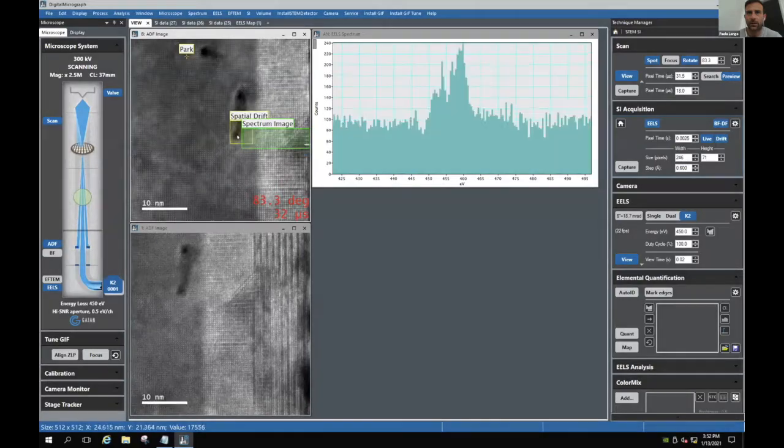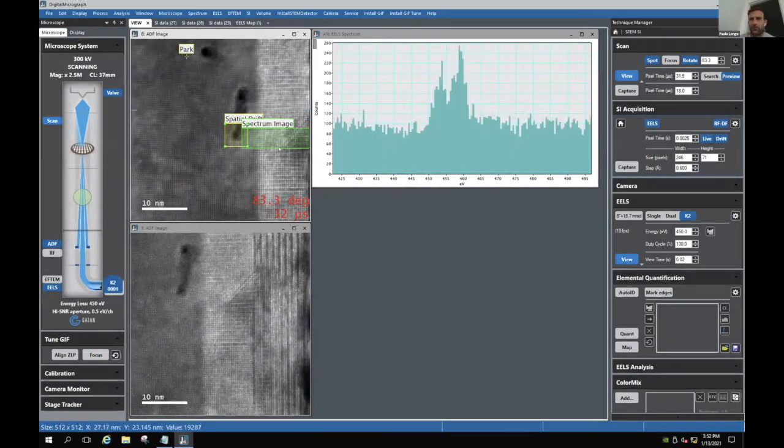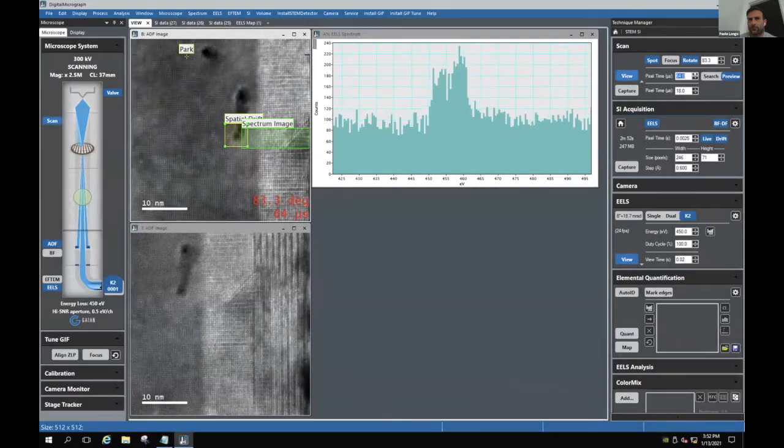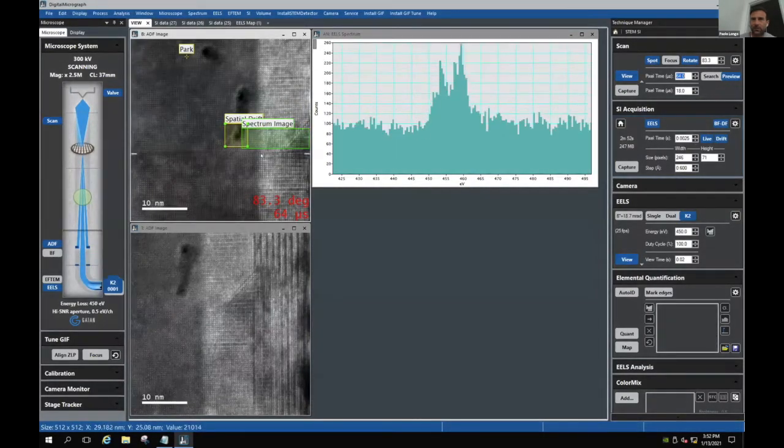I'm going to do it here on this amorphous damage motif, which is a good reference. You don't want to go too far from the region of interest, but you don't want to be too close to the region of interest. We're slightly outside. You bump the exposure time a little bit here because you want to get a good reference image. So now we'll do some drift correction as well. But we're going to do multipass, so that would increase the quality of our data.